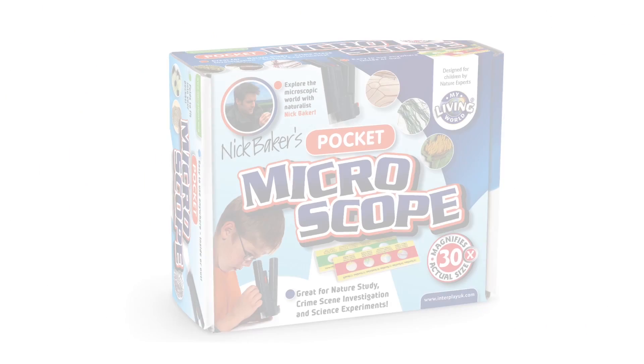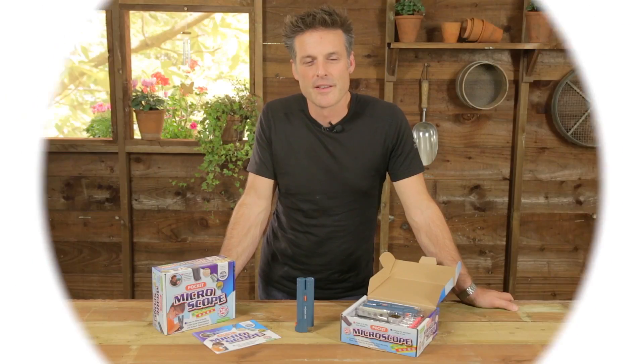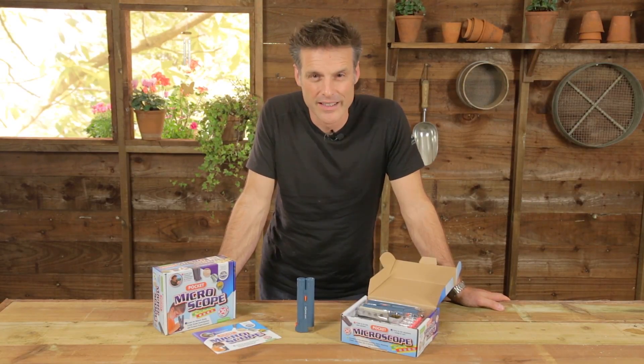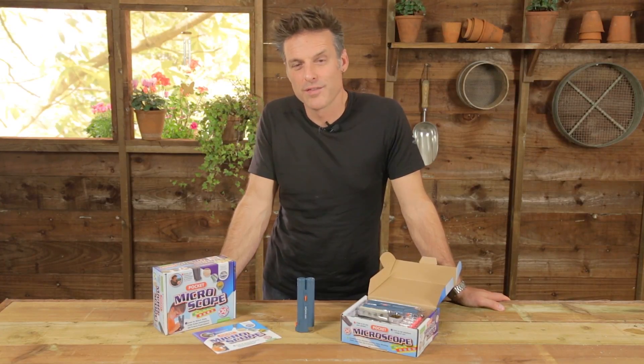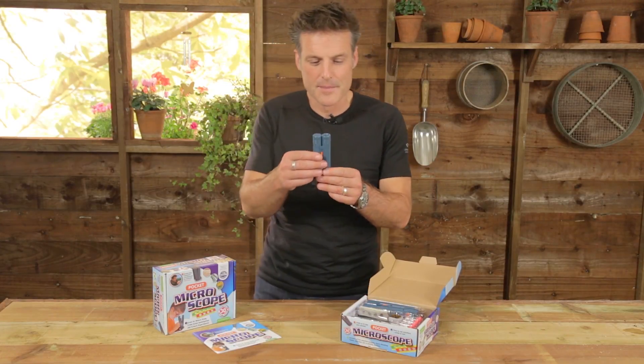Hello, I'm Nick Baker. Let me introduce you to my pocket microscope. There's a whole world out there in a drop of water or a speck of dirt, but the question is how do you really get to see it in a way that's affordable? Well, this is where my pocket microscope kit comes in handy.